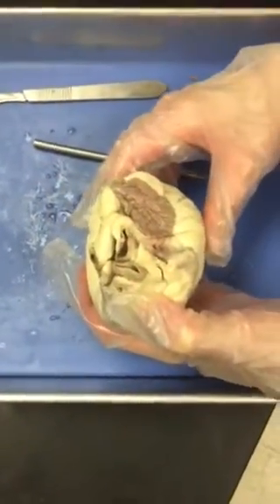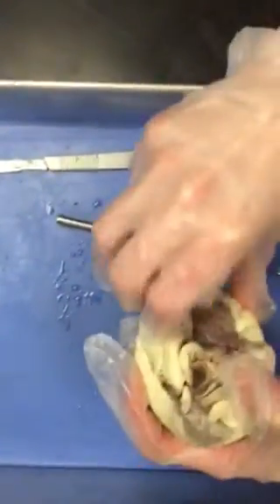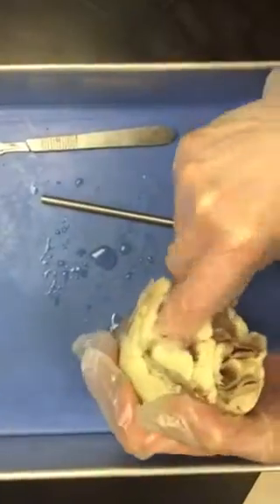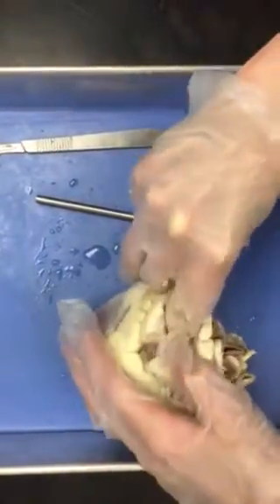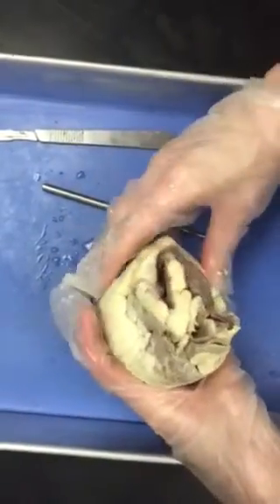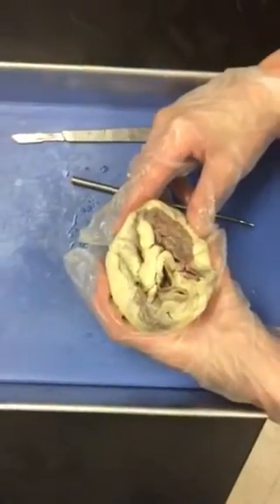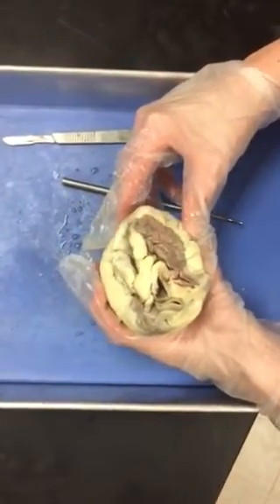21, look to the right, which is really the left, of the aorta and see the pulmonary veins. Use a probe or your finger and see where they lead, and it should be into the left atrium. 22, in the space below, explain the function of the pulmonary veins. 23, if desired, take a picture of your labeled heart or make a sketch of your heart in your laboratory journal.